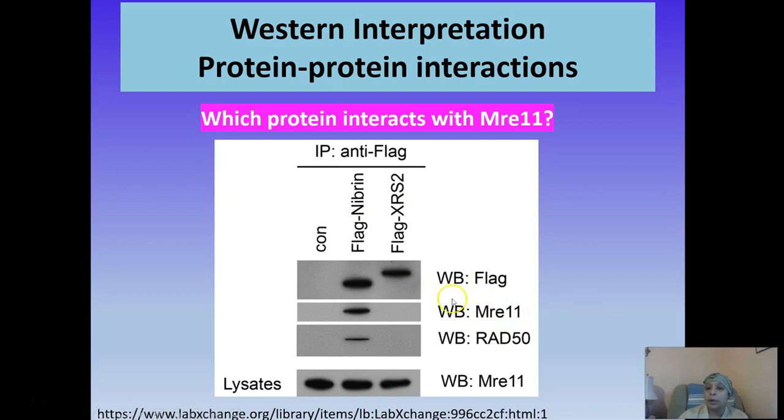Then we do an MRE11 blot to examine which one of these flagged proteins were able to actually also pull out MRE11. And only the flag Nibrin extract, right?